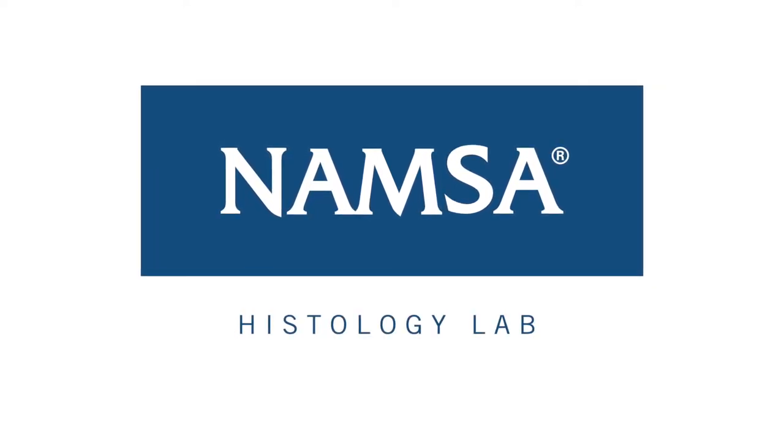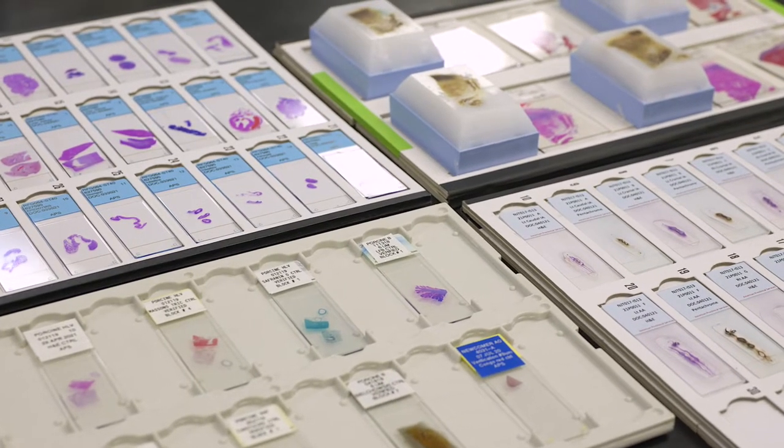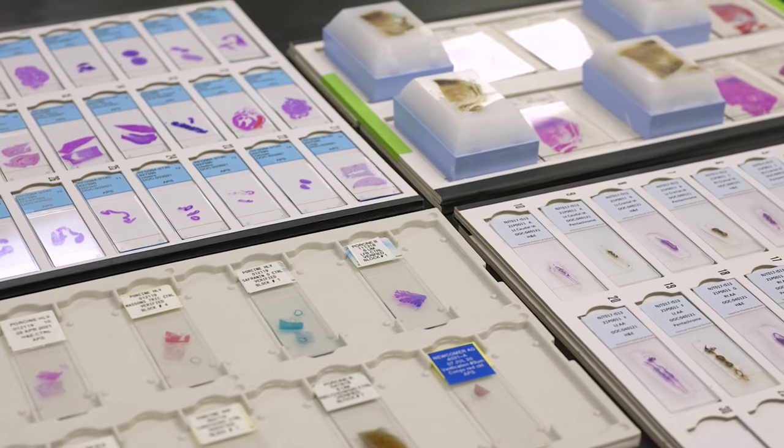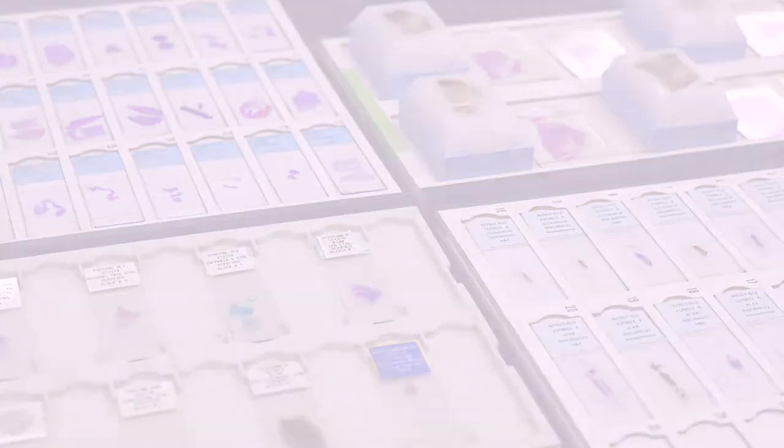Welcome to the NAMSA Histology Lab. NAMSA offers both paraffin and plastic histology processing to provide a comprehensive pathology analysis of your study.